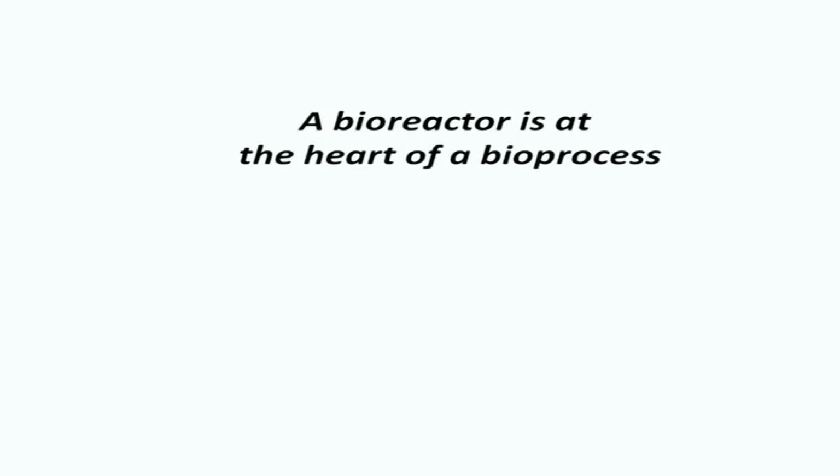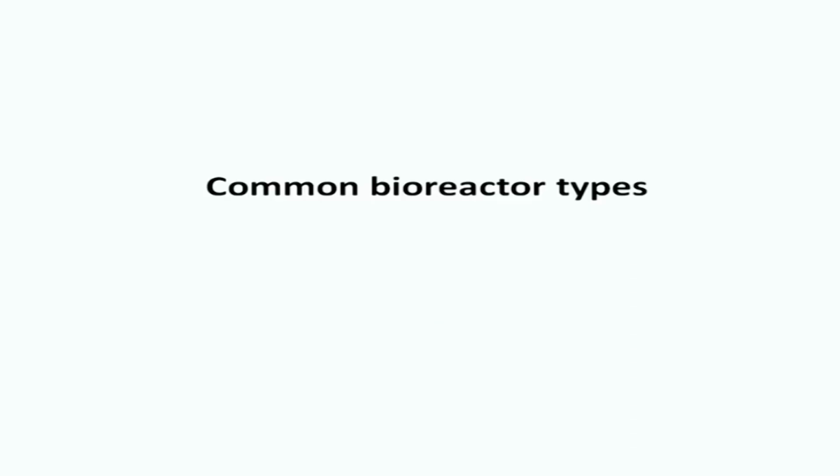As was clear from the previous slide, the bioreactor is at the heart of a bioprocess, necessary for a bioprocess to exist. Now, let us look at some of the common bioreactor types, some of the kinds of bioreactors that are used commonly.